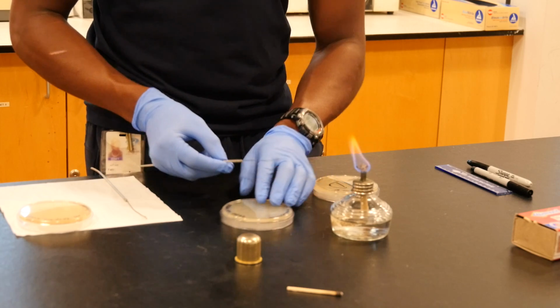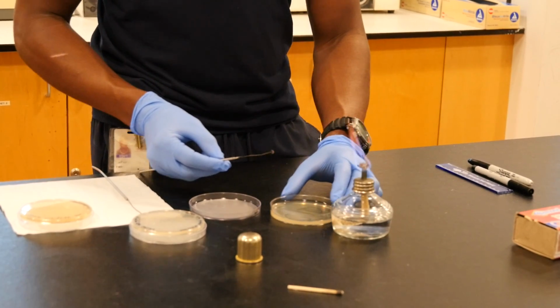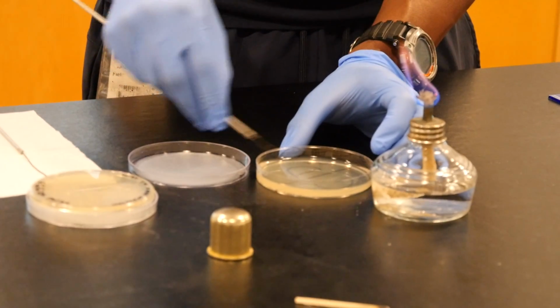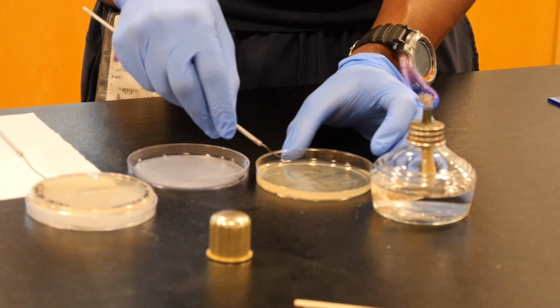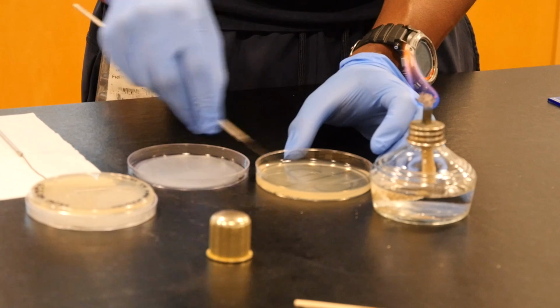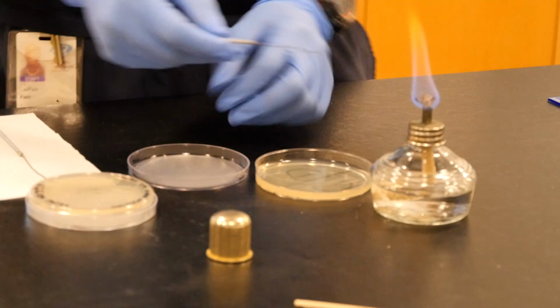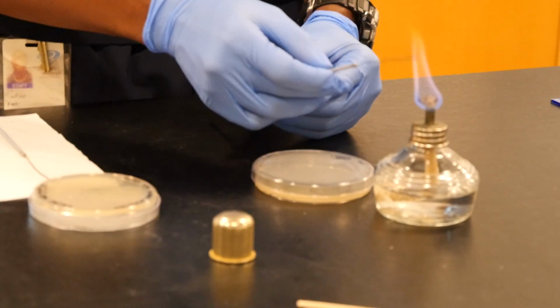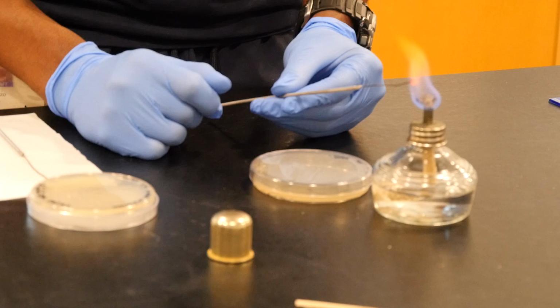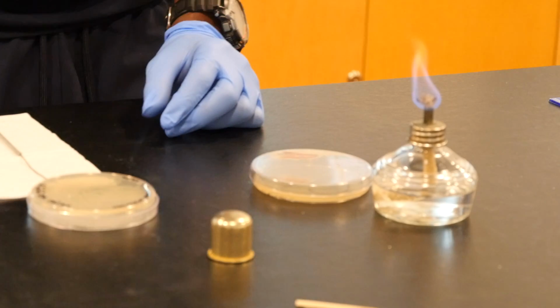From there, I'm going to move my culture plate. I'm going to flip over my agar plate here, make sure that it's close to the burner, and I'm going to give it a good streak within the letters, length and width, okay? You do not want to touch the edges. You do not want to go close to the black line. Now the protocol might say use a swab and alcohol to go across the black line. Do not do that, because depending on the individual, they might use too much alcohol, which would leave too much alcohol in the plate. Okay, so I'm done with one. Place that over there.